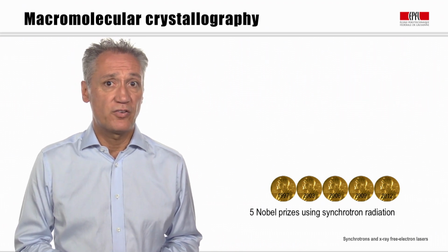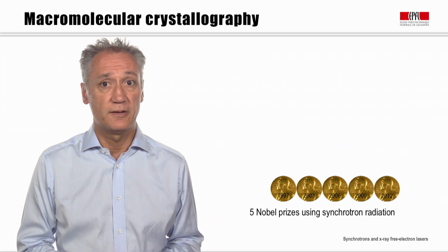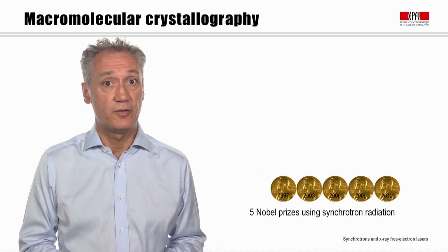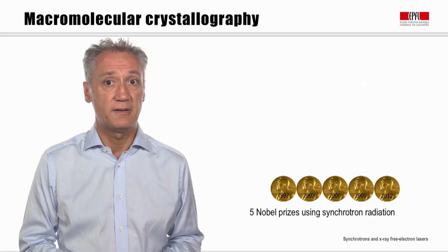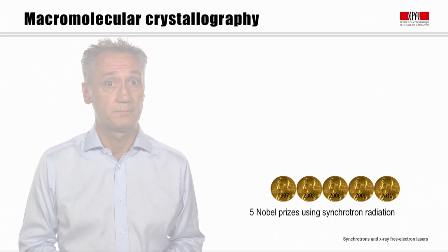The economic drive to synthesize new and increasingly effective drugs based on this detailed knowledge means that MX beamlines are the most ubiquitous in third-generation synchrotron facilities. Despite this, and the burgeoning number of facilities being built, there remains a high overbooking factor for MX beamlines.